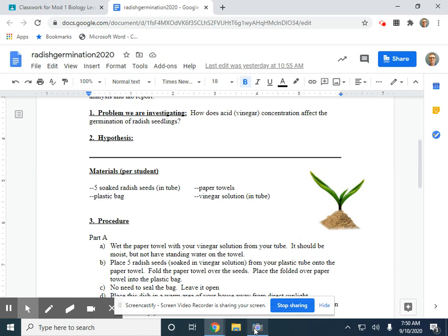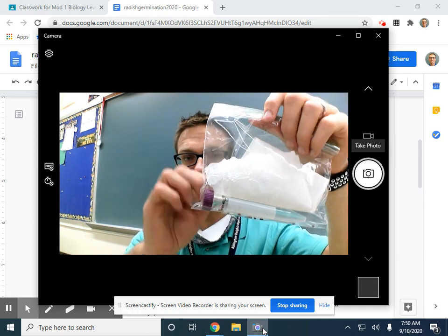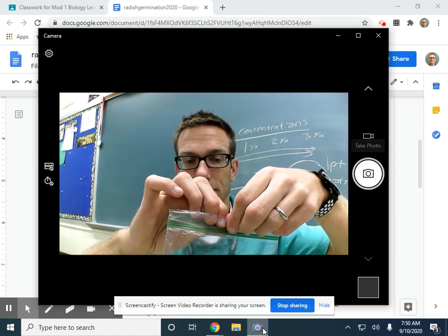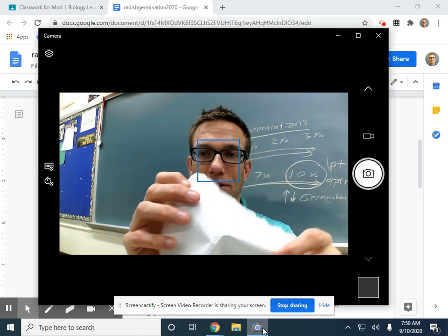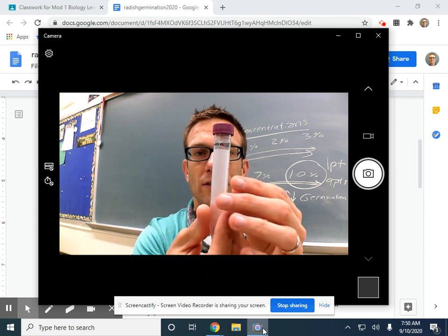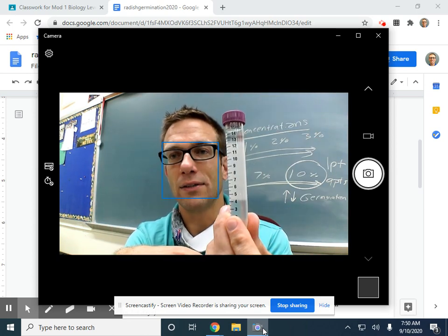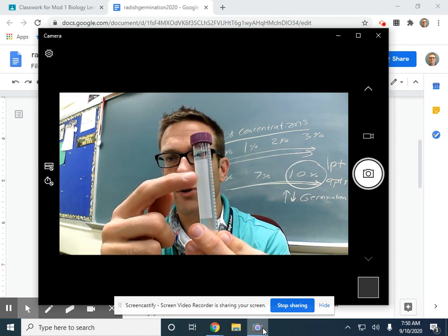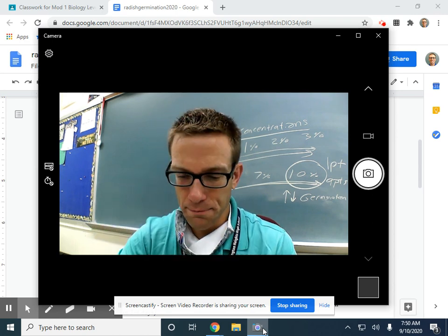Okay, so let me show you what I had given you when you stopped by. You have a bag, and inside you all receive the paper towel, nothing fancy. I'm just going to put that on the desk in front of me. You all received this tube that has a screw cap on it, so I can give you something without it dumping everywhere. And over here you have written your percentage of vinegar. I have it filled up pretty much to the top.